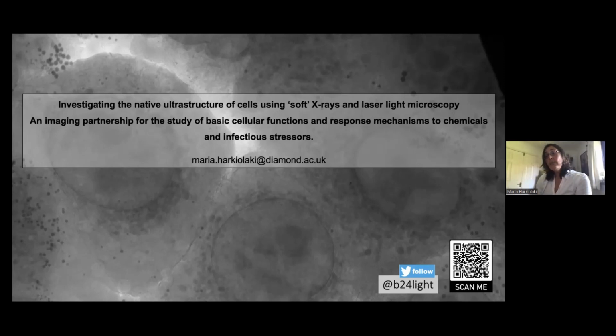Also, the samples can be prepared anywhere in the world, and you have cryo-shippers, the same as for crystallography, which can travel across the world and keep things frozen for a good couple of days, 2-3 days. So that is never a problem, well, sometimes there is, because customs can be quite weird. But trust me, we get samples easier from your side of the world than the rest of Europe right now. So it's a bit of an investment of time if you don't have a cryogenic facility, but we either can provide our expertise or we can teach somebody, and then that somebody becomes the expert in their group.